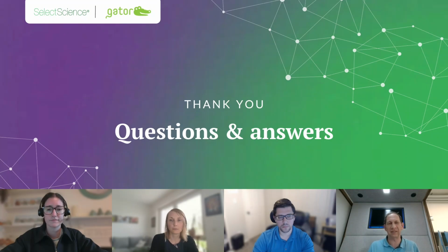So it's not that there are no issues. Sometimes we programmed the instrument wrong, but then we find it out and we fix it for all of the next experiments. And once in a while, one of the tip boxes was not arranged well and there is an issue, but it's not like people sometimes forgetting something along the way, which unfortunately will happen when you have 20 different steps and 50 different projects run by 10 different people in the lab every day.